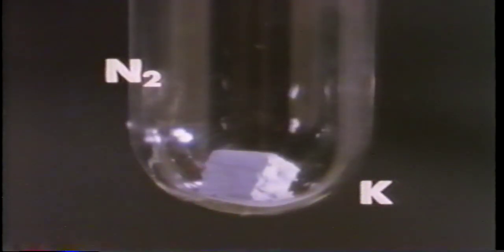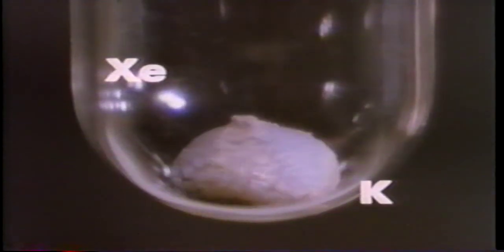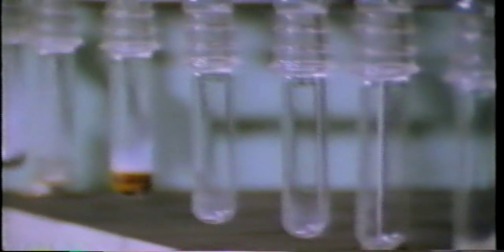Our next gas is nitrogen. Nitrogen does not react. How about oxygen? It didn't take much heating to start that reaction. Oxygen is certainly reactive with potassium. And now the last one, xenon. Xenon is inert with potassium. Comparing all the tubes, we find 4 of the gases gave white, solid products with potassium. Apparently, the other 6 gases are inert toward molten potassium.